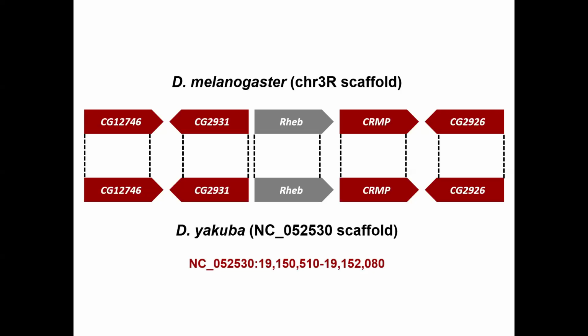Keep in mind that if your target species assembly happens to have been numbered from the opposite end of the relevant scaffold, then the orientation of the orthologs could be the opposite of what you see in the melanogaster, but still be syntenic.